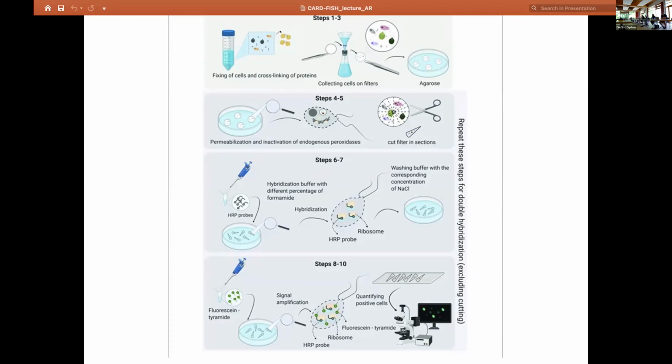Then all the fluorochromes go through these enzymes from the probes, and with this signal, they change the conformation of the fluorochromes. They become reactive, and they are attached to the membrane of the cell. Okay, again, for FISH, you have one probe, one fluorochrome, and that is your signal. In this case, we are amplifying the signal, and this signal goes to the membrane of the cell. So you have much brighter images of the positive cells.